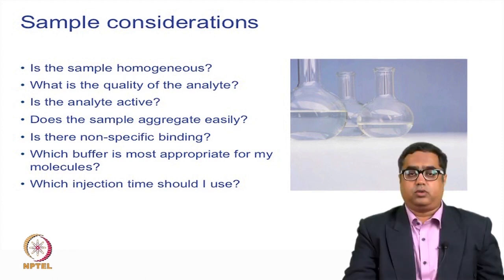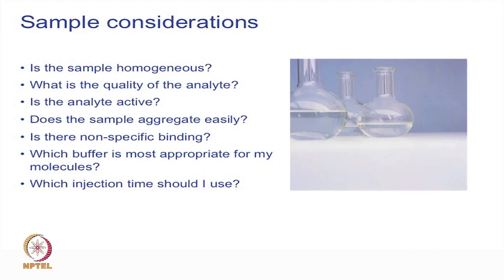And it is very important to understand the right buffer for the right sample. Also, once we have identified the good sample conditions, then we should think about the association time and the time at which we need to set up our Biacore experiments.